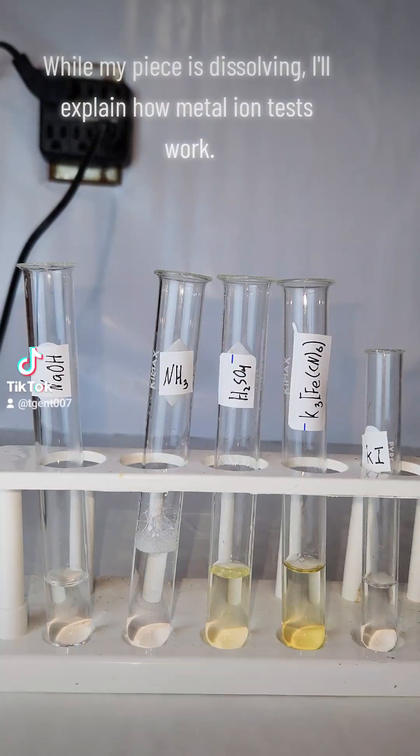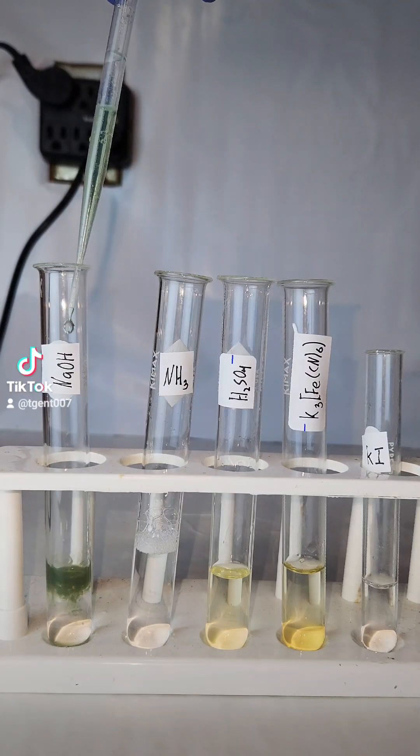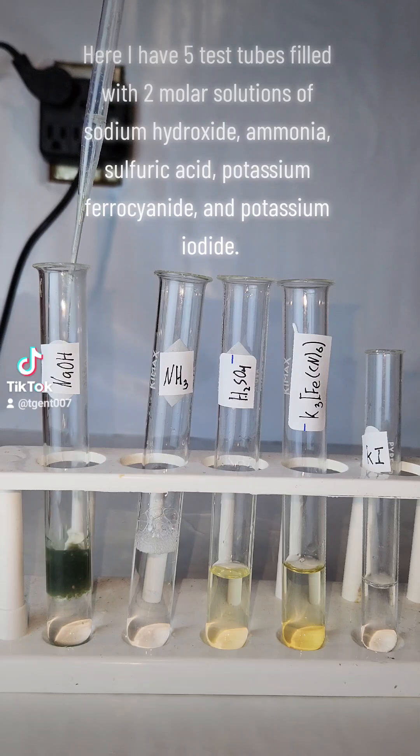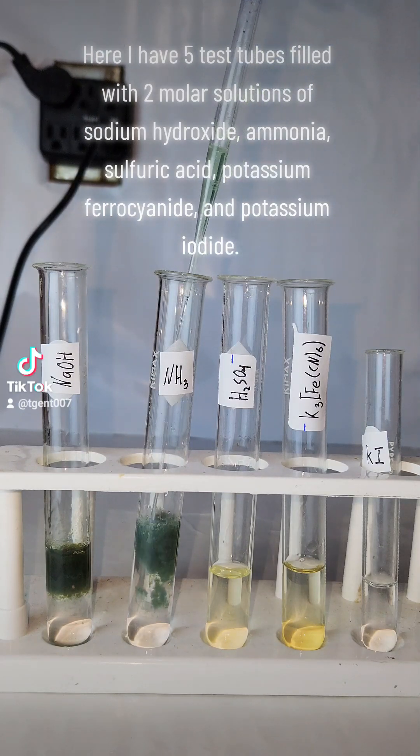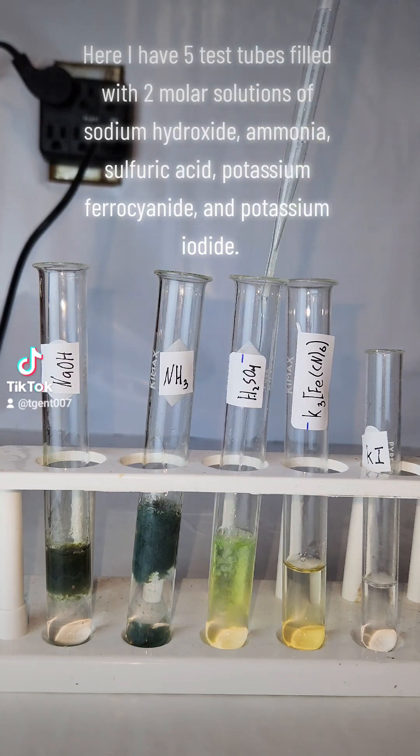While my piece is dissolving, I'll explain how metal ion tests work. Here I have five test tubes filled with 2 molar solutions of sodium hydroxide, ammonia, sulfuric acid, potassium ferrocyanide, and potassium iodide.